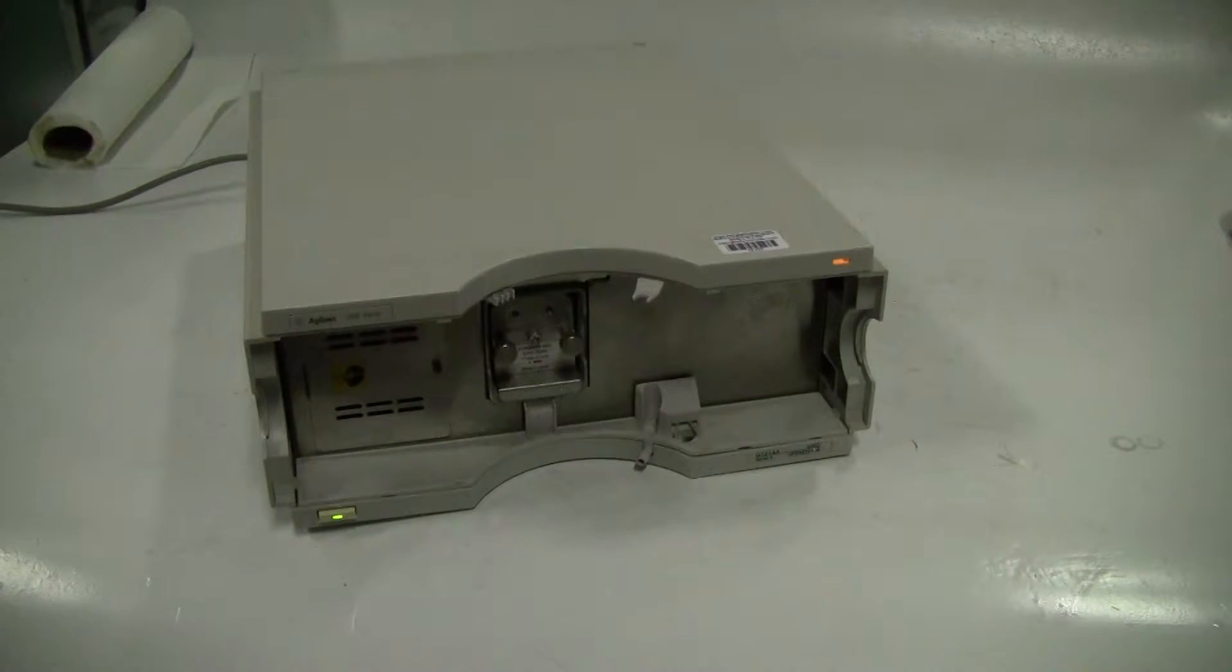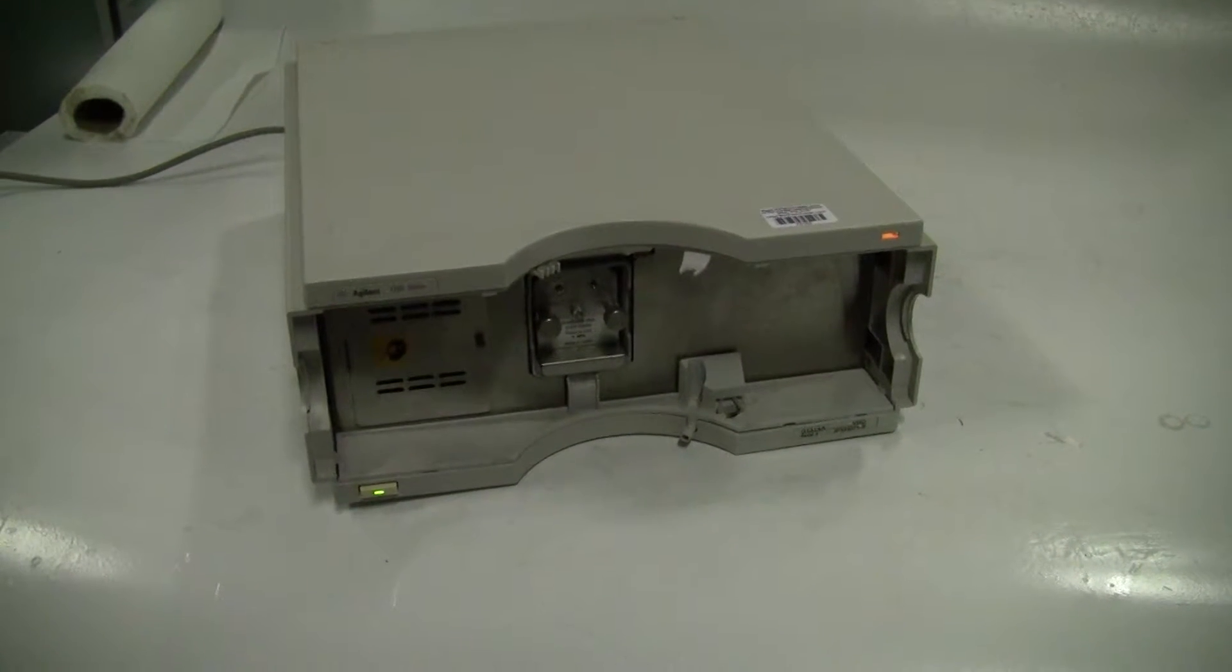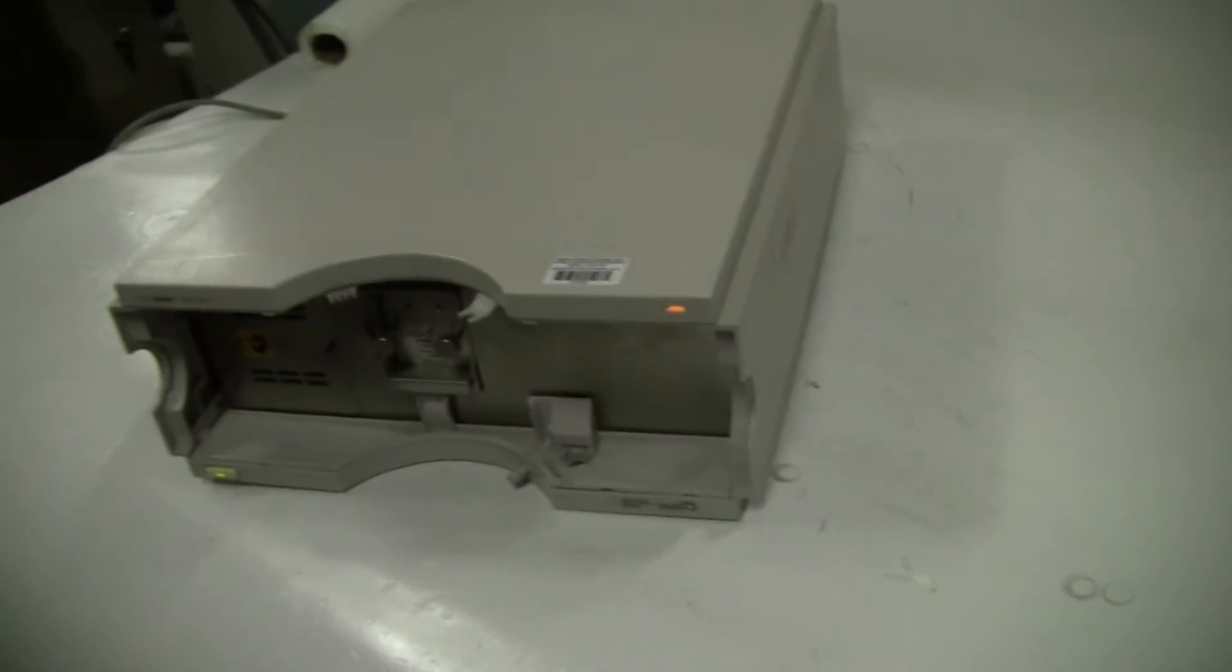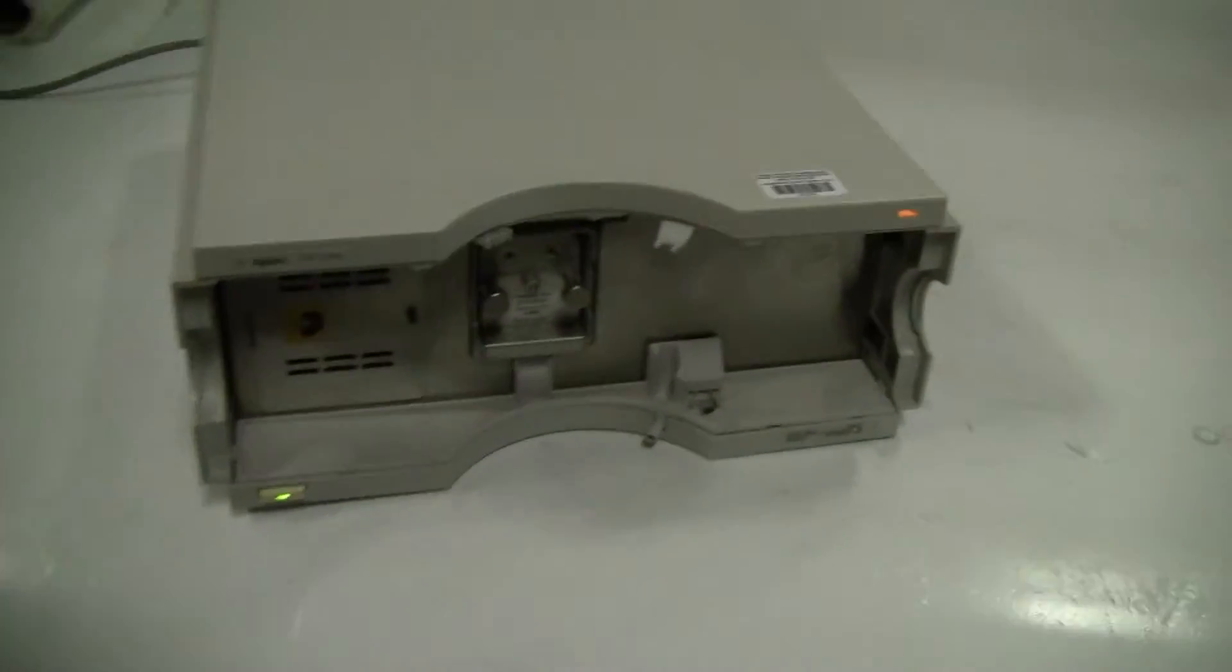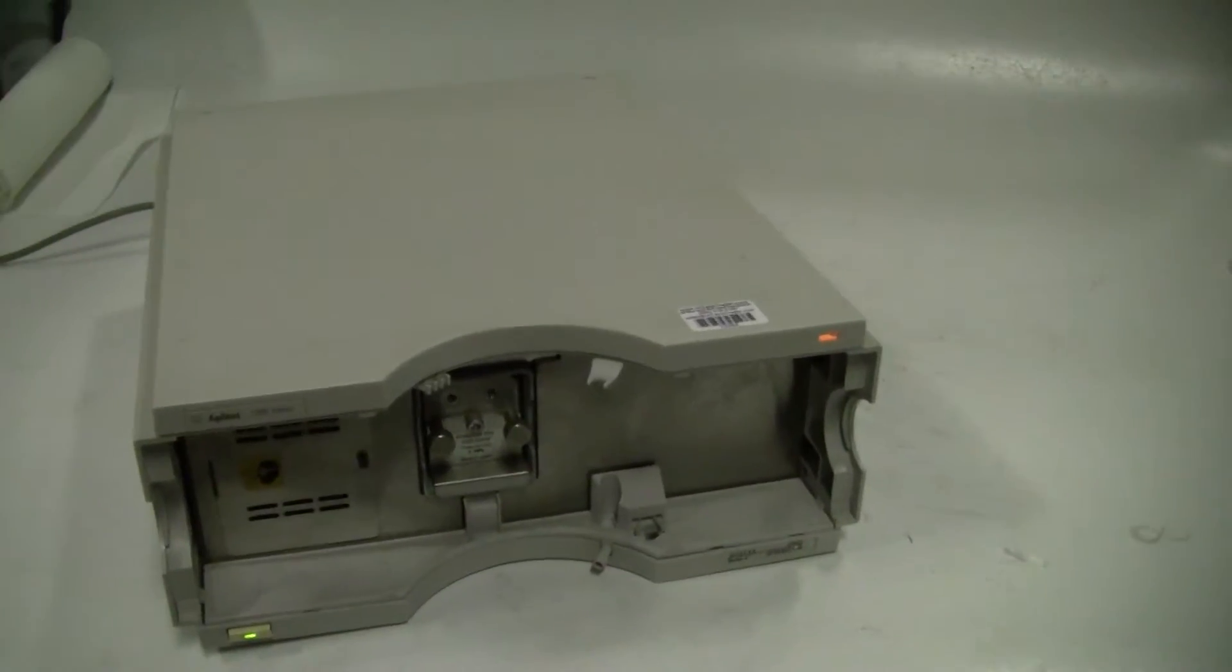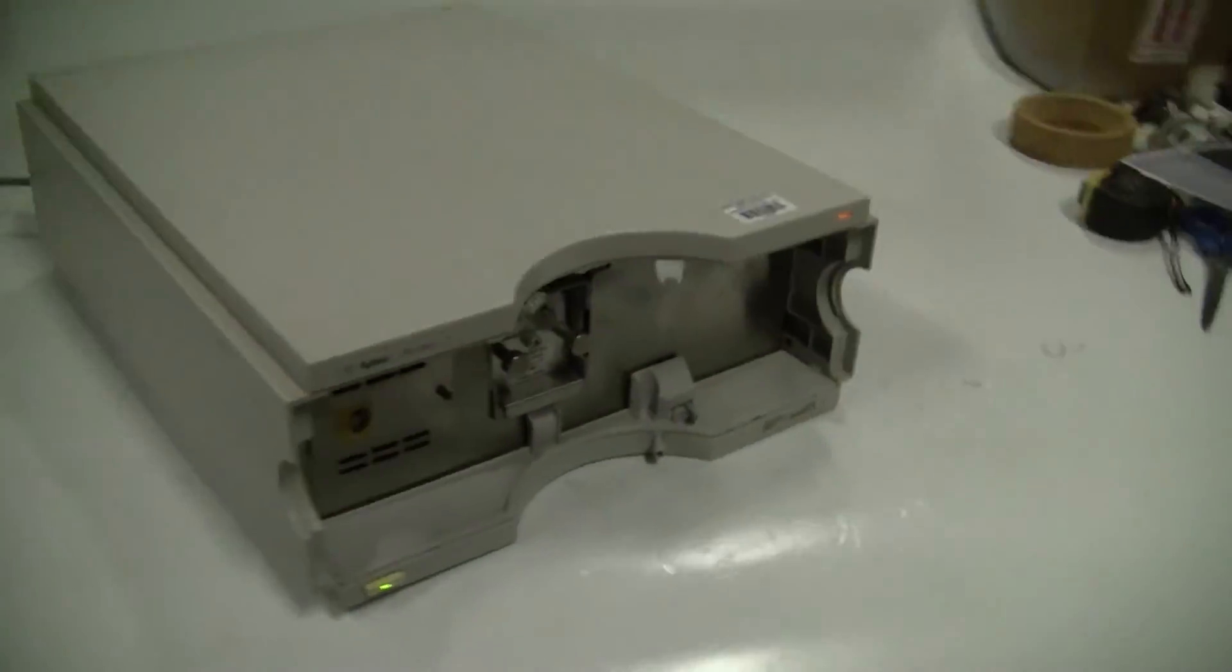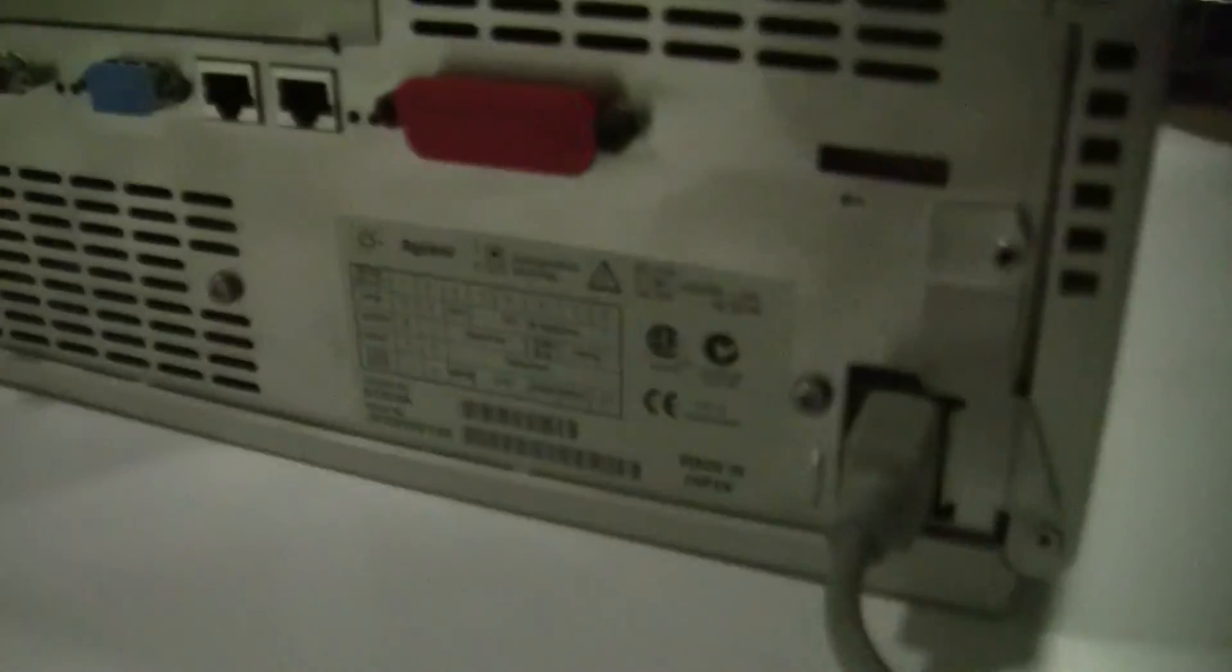This is just a quick overview indicating that we got another unit in. It looks to be in fairly good condition. We're not getting the red light, which is always a good sign. Let's look at the rear of the unit. Standard back.